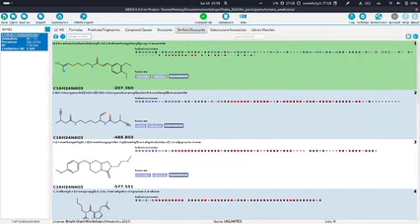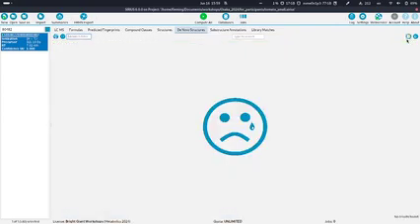Actually, this will look exactly the same, because the tab is named de novo structures, and it is meant for the MS Novelist hits. But by default, we have this little button active, which says show the MS Novelist results and the CSI:FingerID results together. If we turned it off, we would see that we don't have any results here, so we have not run MS Novelist for this particular compound.